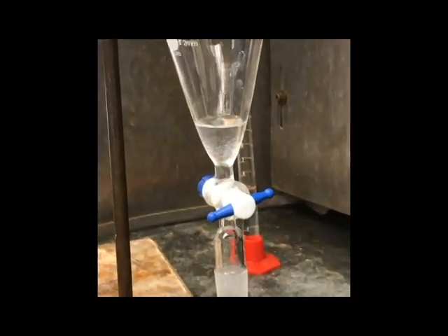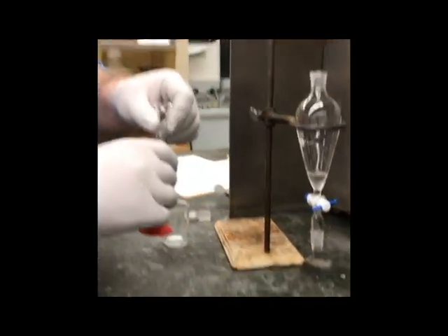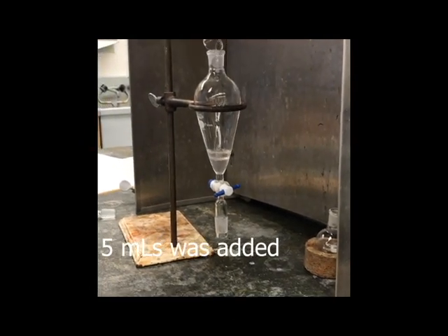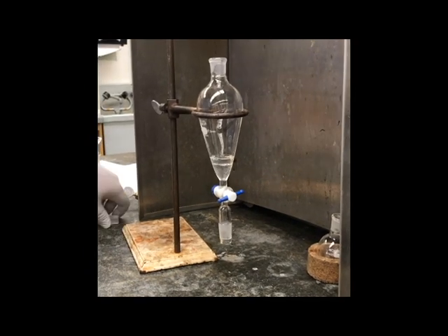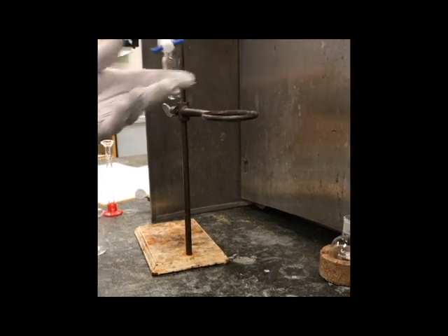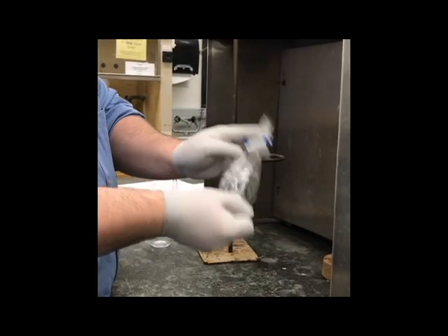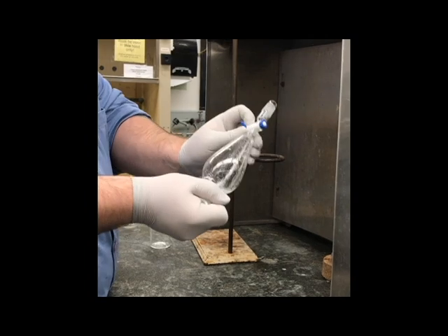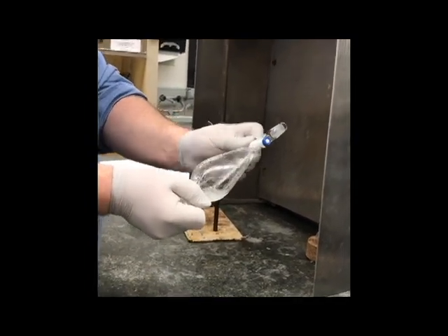And now we're going to perform our first wash. Our first wash is done with a 10% solution of sodium carbonate. This is just going to be emptied into here, like so. And then we are going to stop this. We're going to take it out. We're going to invert it, open, then slightly shake, venting frequently until the layers have been sufficiently mixed together and all the acid has been neutralized.